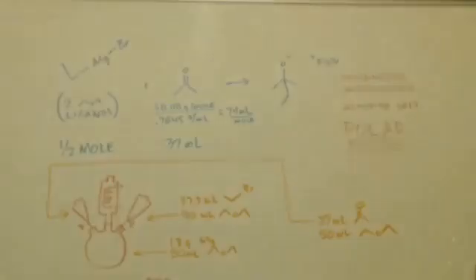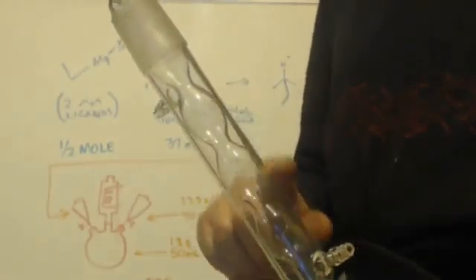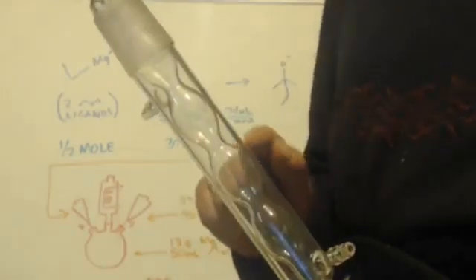Now, the water-cooled condensers — I'm not going over every example. There's cold fingers, there's hundreds of different types. Here's one example. See how there's little bulbs in there? That is an Allihn condenser. See the bulbs? That's how you know it's Allihn, because it has those little bulbs in it.